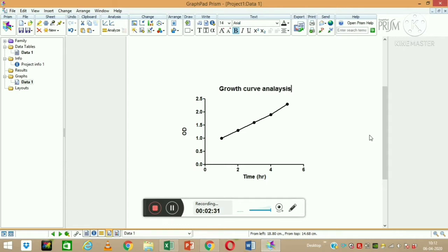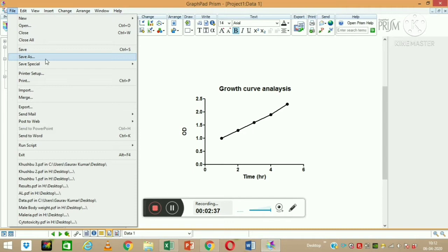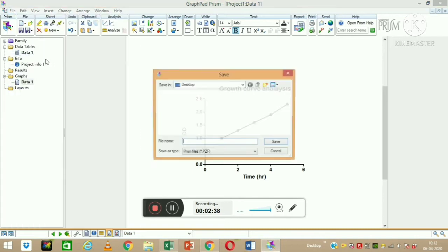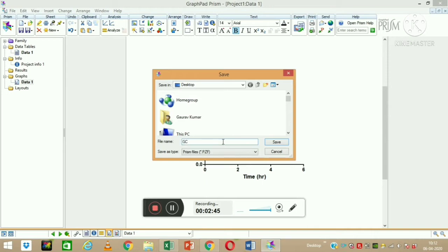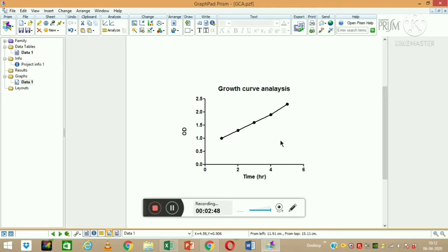This is how I make this graph — it is labeled as growth curve analysis. Now I can save it. I will go to File > Save As and save it on the desktop with the name 'growth curve analysis' or GCA.